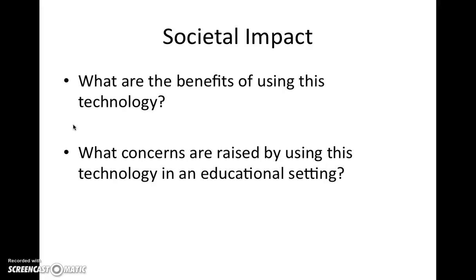As I mentioned previously, because this lab is happening in the virtual world and not the physical world, schools won't be limited by very expensive chemicals or glassware or other materials. So really, whatever a teacher wants to implement as a lab procedure, the students can follow through and actually do that without worrying about those resources.